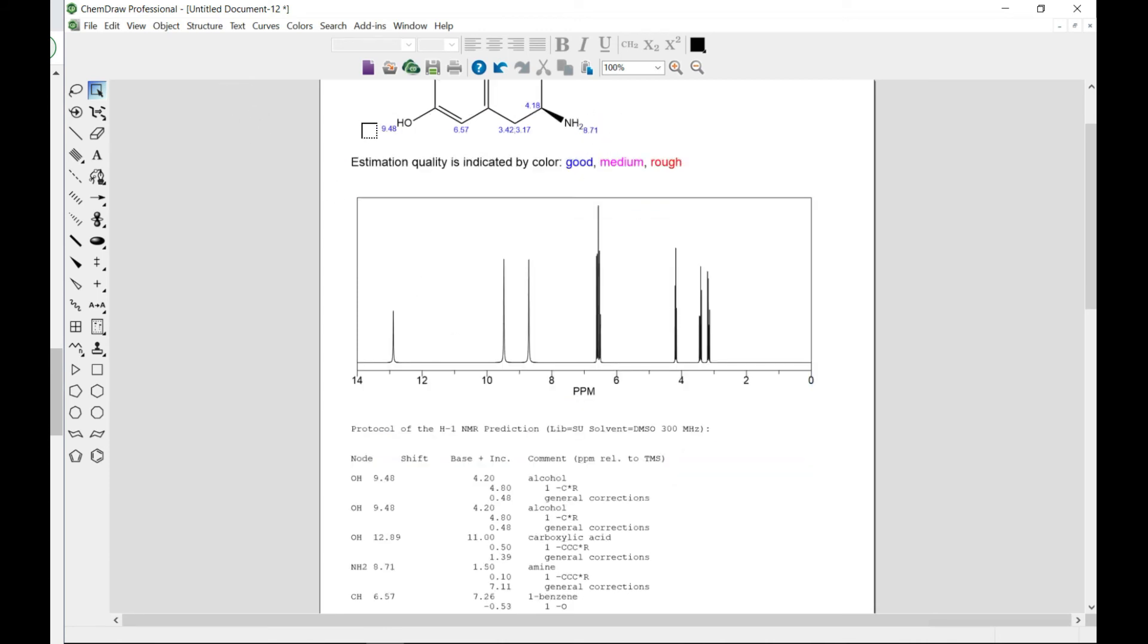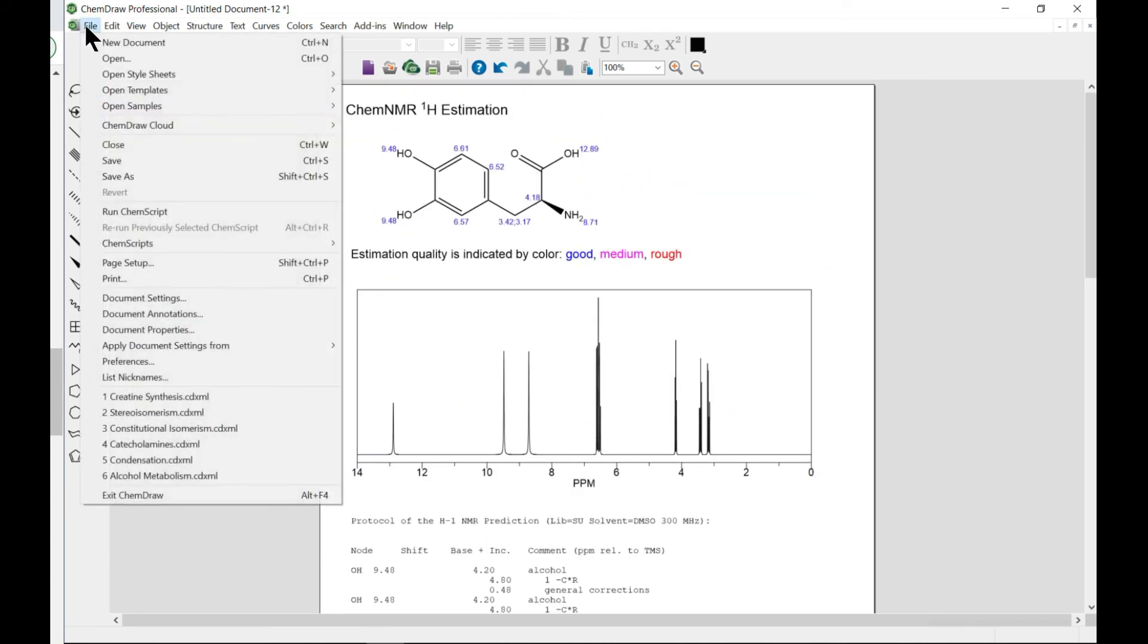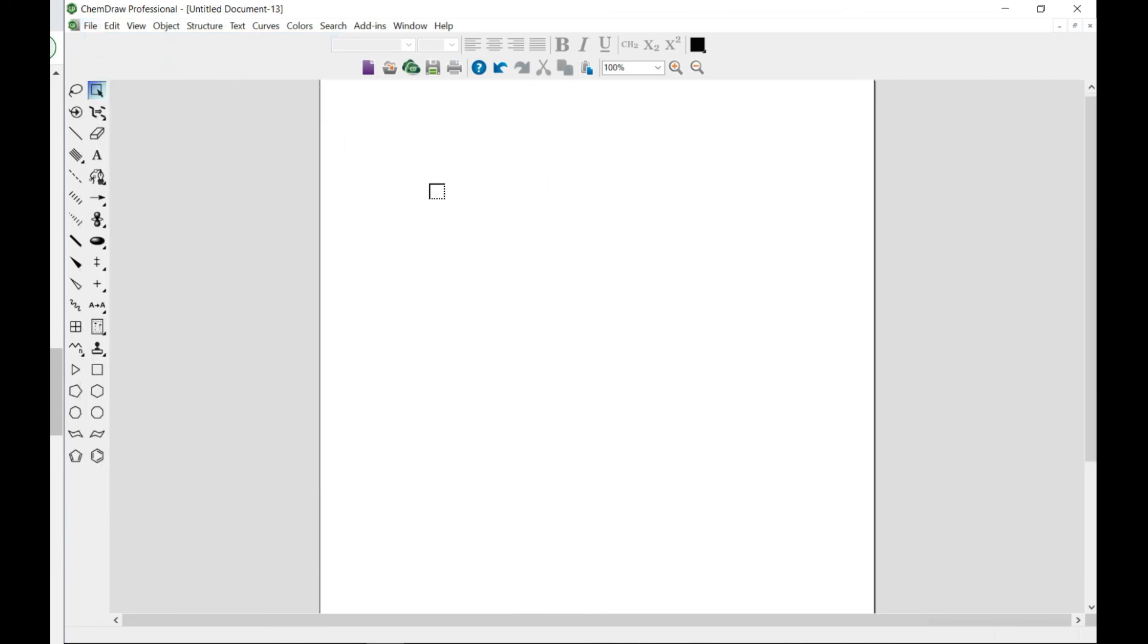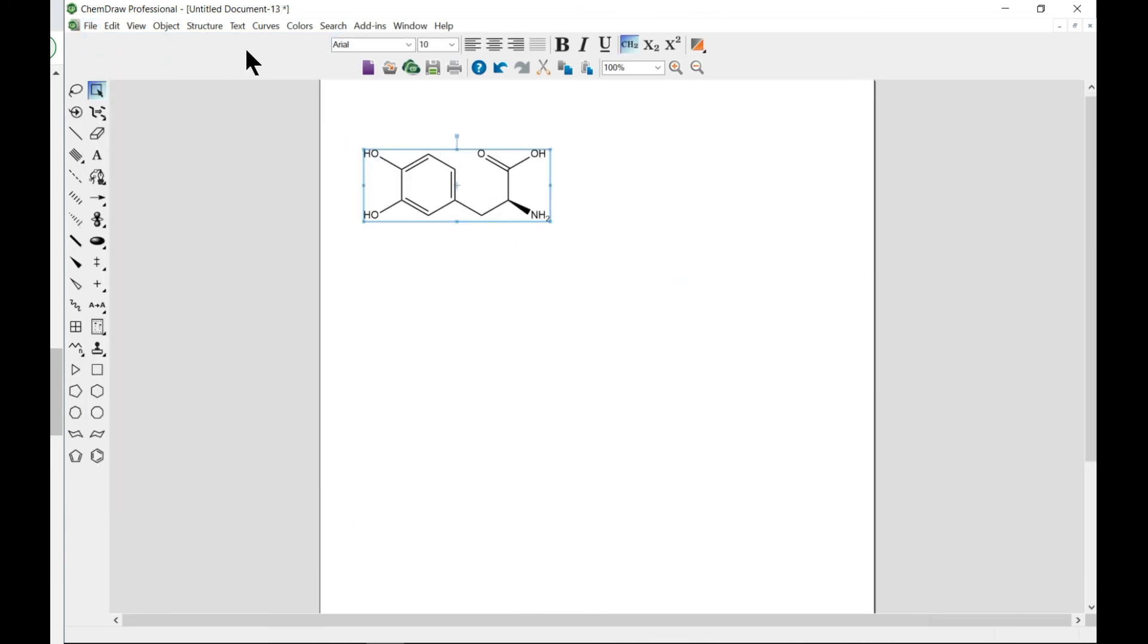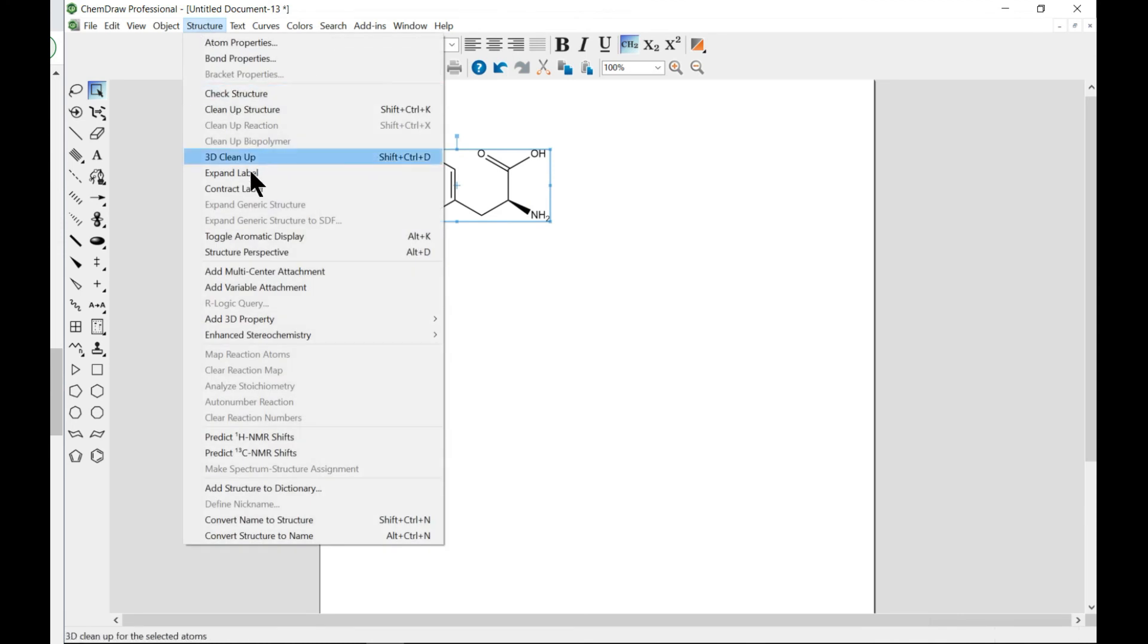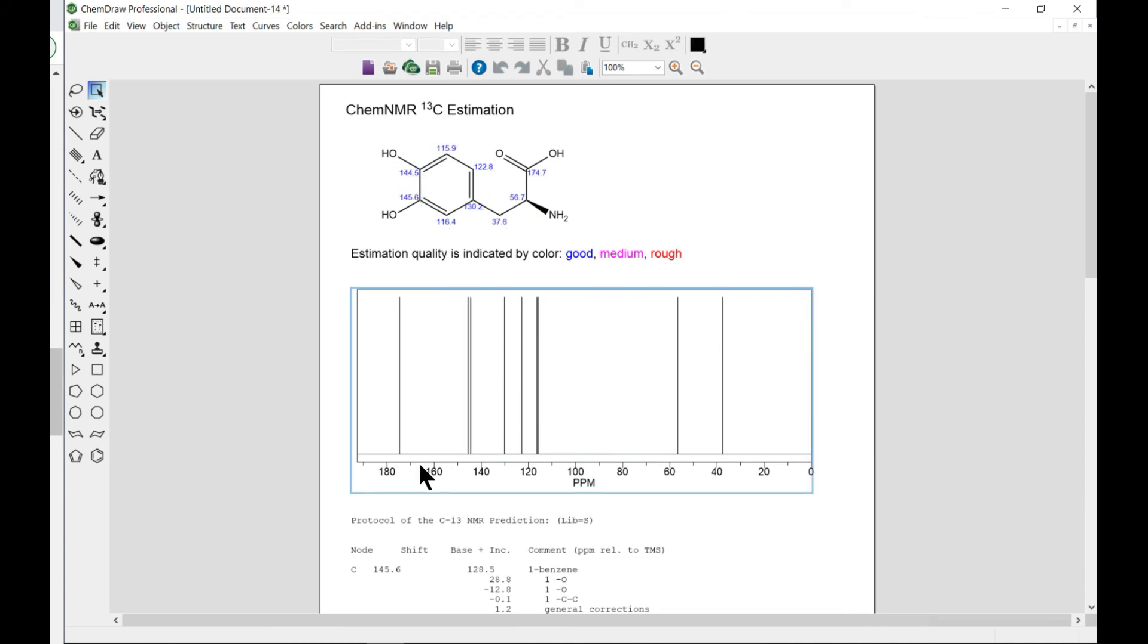You can always go in and explore others. So let's try again with carbon. So let's paste structure and carbon. And that is also different. So that gives us different intensities as well.